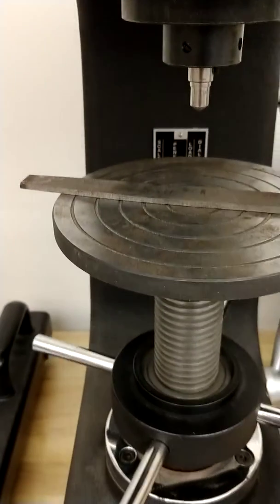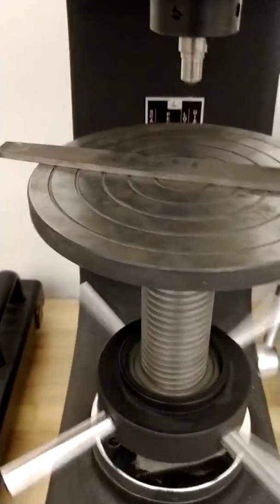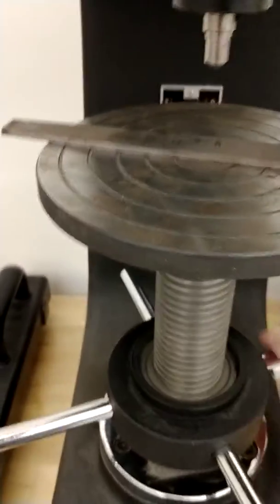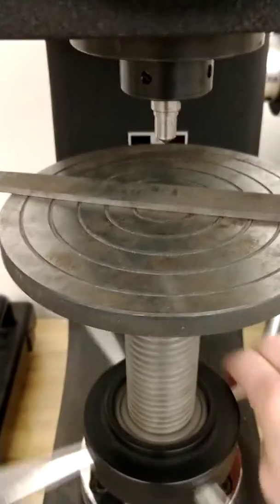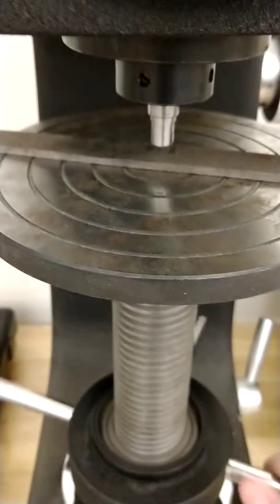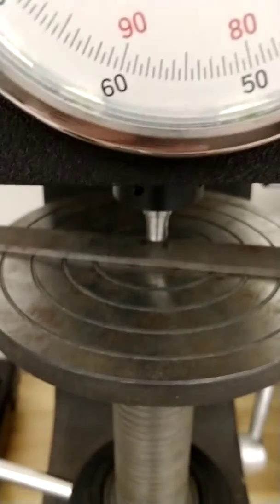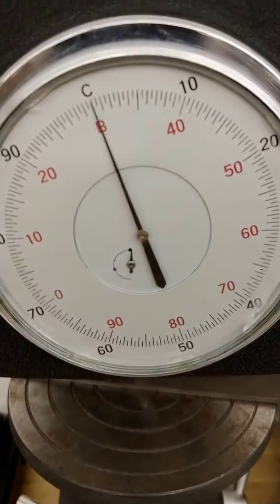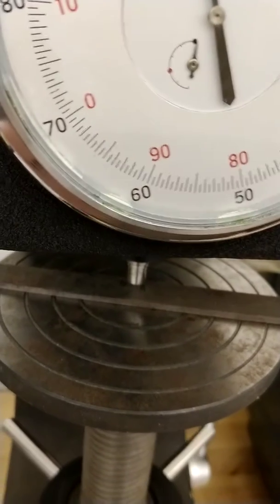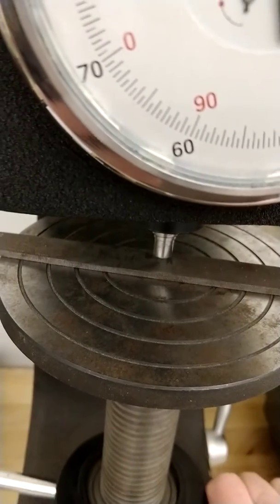We're going to turn the hand wheel on the nut clockwise, and that's going to raise the table up. It'll take quite a few turns and you can do it fairly quickly at the beginning. But as you reach the indenter, you want to move a little bit slower because you don't want to smash the table and the part into the indenter — you can break the industrial diamond. I'm coming up here and I want to make sure the part is aligned underneath the indenter. Notice the dial has not moved because I'm not in contact with the indenter just yet, and I'm coming into contact right now.